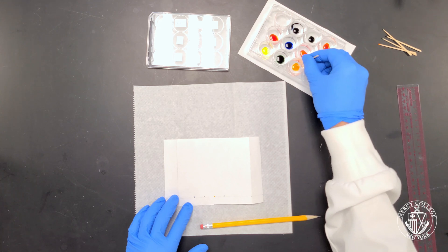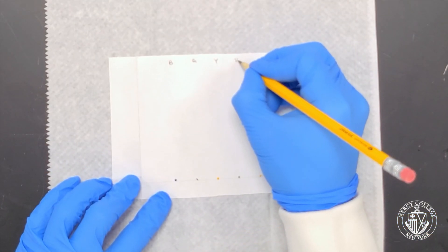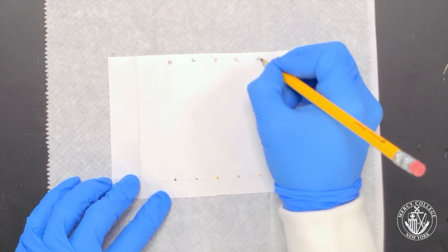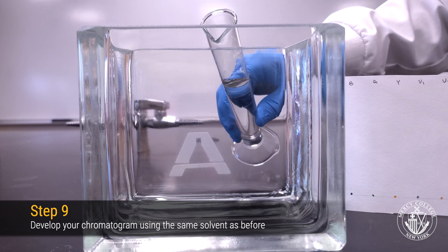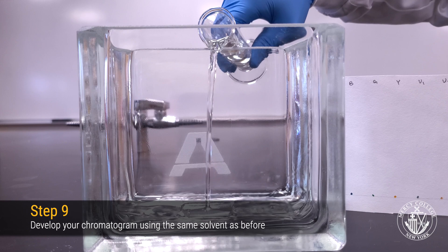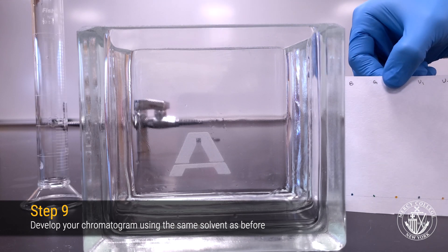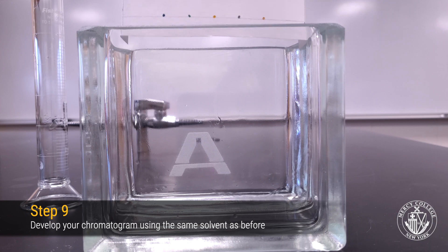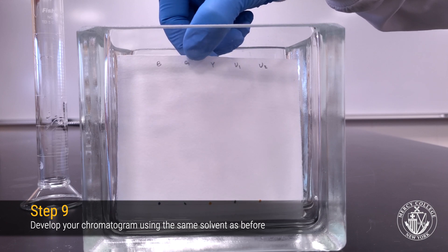When you're done spotting your chromatography paper, remember to label each lane of your chromatogram in the same order in which you applied the dyes. Now you're ready to develop your second chromatogram. It's not necessary to start with a clean developing chamber and new developing solution — you can reuse the same developing chamber and solution from Part A. Once your chamber is ready, place your chromatogram in the developing chamber, making sure that your developing solution is below the baseline.